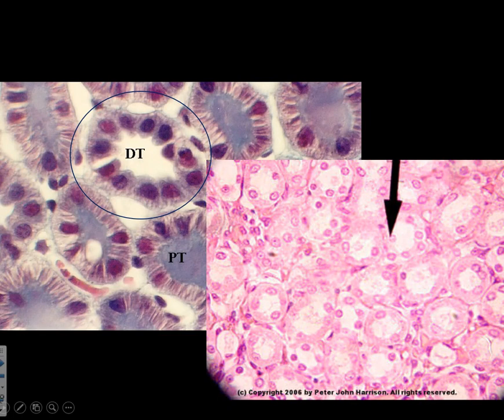All right, let's take a look at this one. Well, first off, I can see a whole ring here where these cells are not attached to other cells. That is the apical surface right there. Then I can see the side of the tissue where it does attach to other tissue. Right there, and that'll be the basal surface.